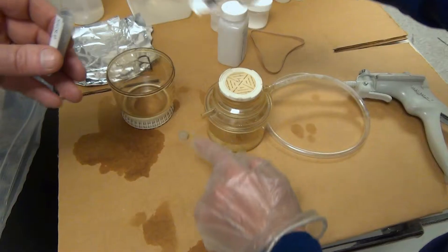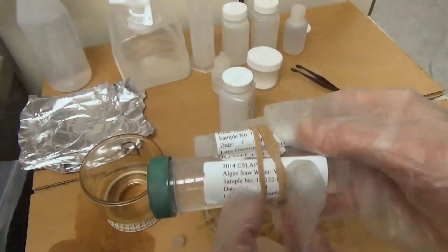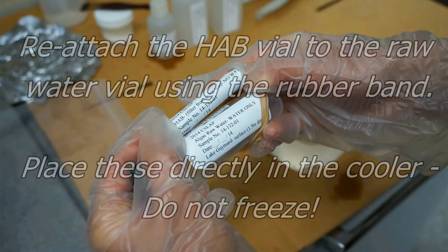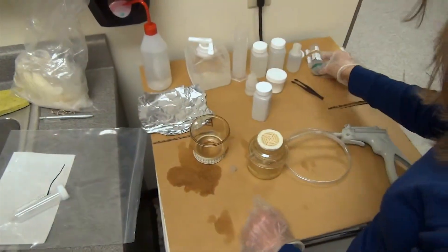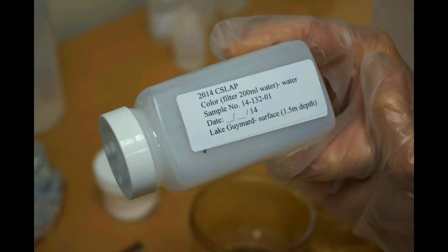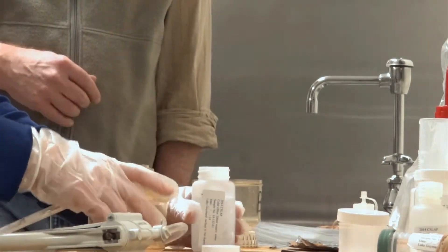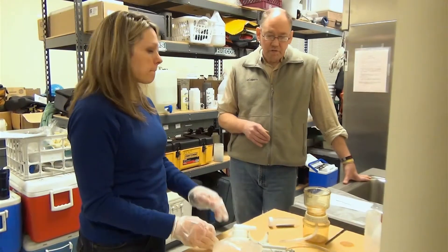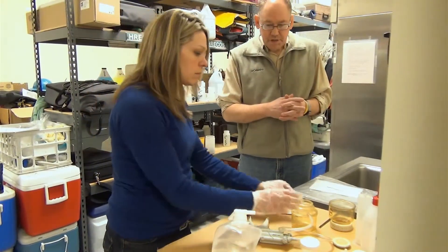Fold it once more and reconnect with the rubber band. Take the water from the receiving flask and place it into the bottle marked color test, then place that with the other bottles. The last procedure is the chlorophyll filtration, which measures algae in the water. You'll run through almost exactly the same procedure as before.